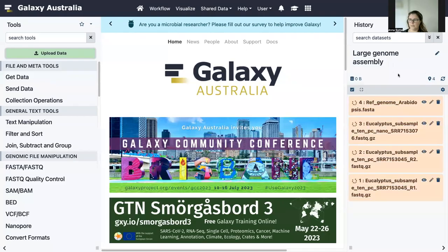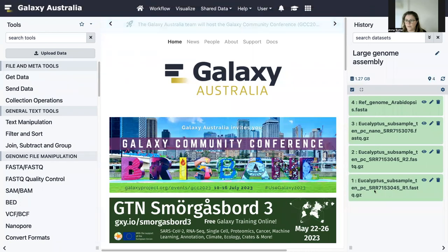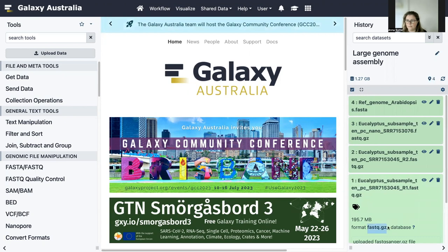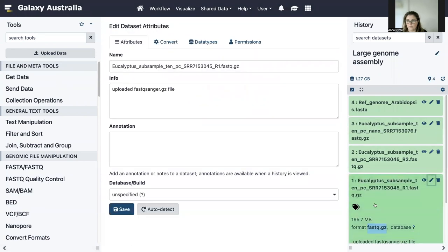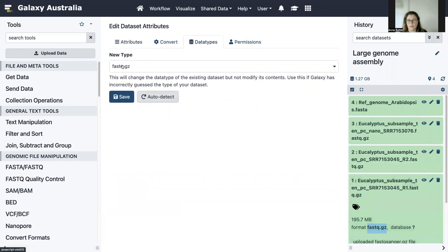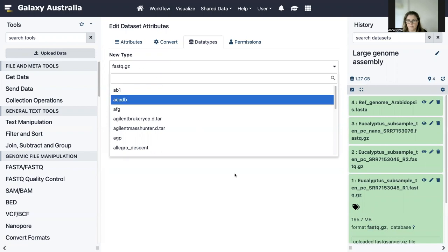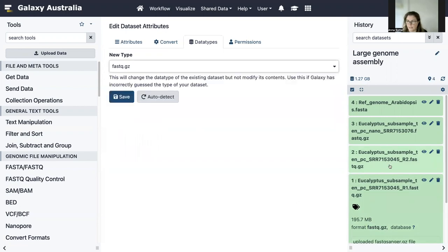These files will now start to load into the current history. Now our files have imported and we just need to check that they're in the correct format. You'll notice you've got three eucalyptus files — they've got the sequencing reads in them and we need to check they're in the format fastq.gz. If they're not in that format, make sure you click on the pencil icon for each of these three eucalyptus files and assign the correct data type, which is fastq.gz. Sometimes Galaxy will upload them as fastqsanger.gz, but they need to be fastq.gz for this tutorial.